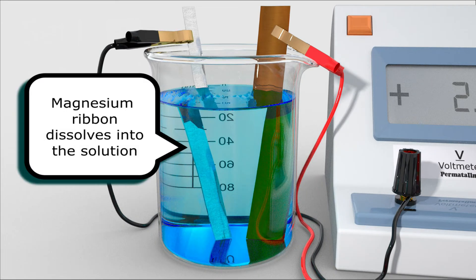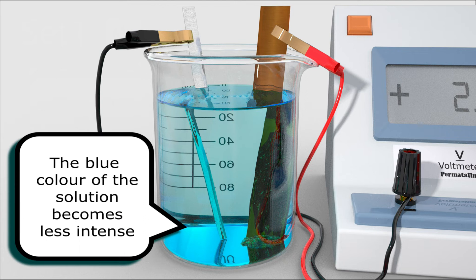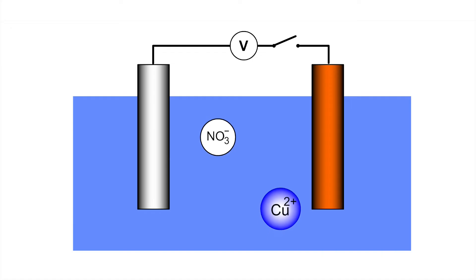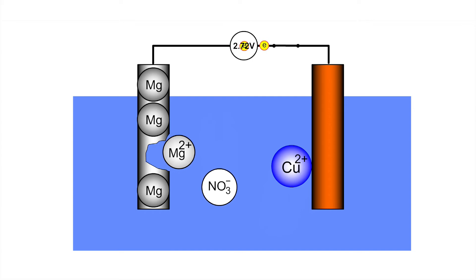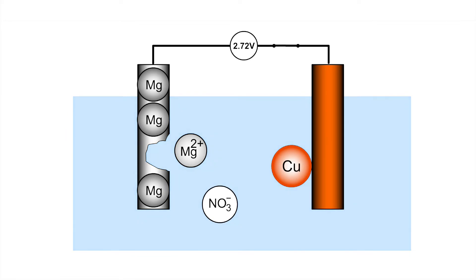We can see the magnesium ribbon slowly becoming thinner, dissolving into the solution. A brown solid deposit forms on the copper electrode, which eventually falls to the bottom of the beaker. The blue colour of the solution becomes increasingly faded. A magnesium atom releases two electrons, which move through the outer circuit from magnesium to the copper electrode. On the surface of the copper metal, a copper ion receives two electrons and is discharged to form a copper atom, which is deposited on the surface.